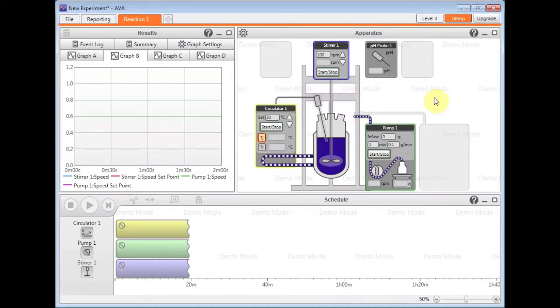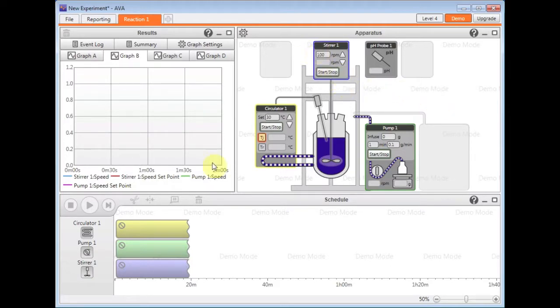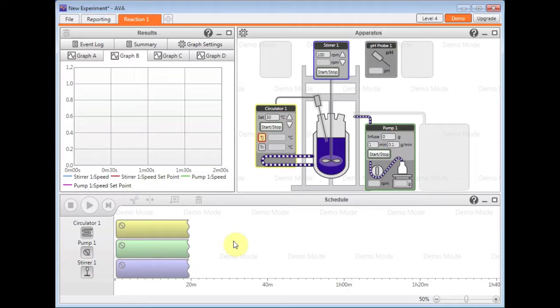Now my equipment has been added, I have a choice of where I control them from. I can either control them from the apparatus window by simply clicking on the start and stop buttons and setting values directly, or I can, if I wish, program a profile along the bottom to run step-by-step what you want the equipment to do.